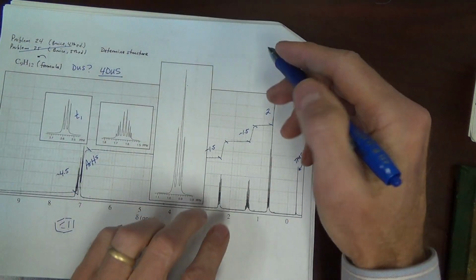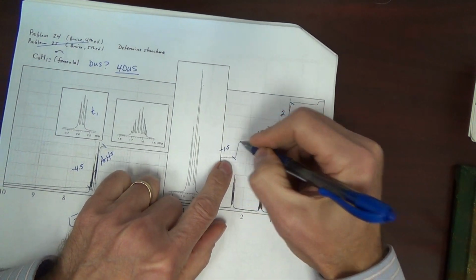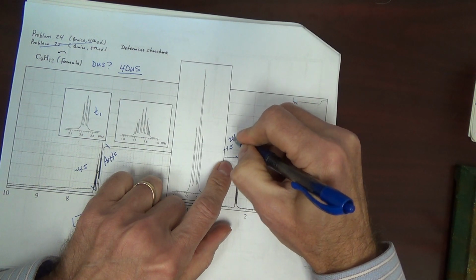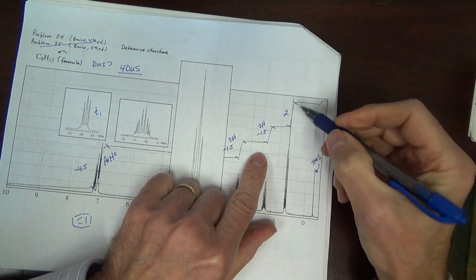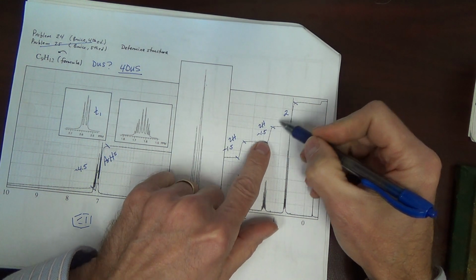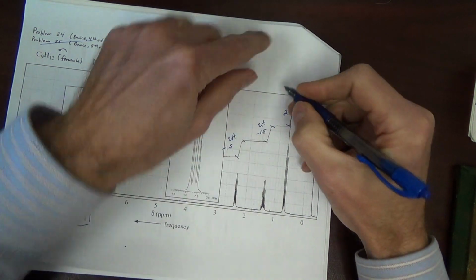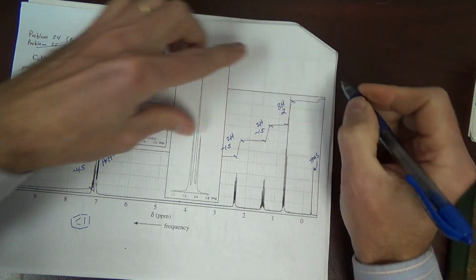So, instead, I'm going to say perhaps this is 2H. Now I'm going to write it here, and I could be writing in pencil so I could erase, but what if this is 2H? That means this is 2H, and then this is not double, because double would be 3, so it's not 4, but it's a little bit more, and this is 3H. Okay?